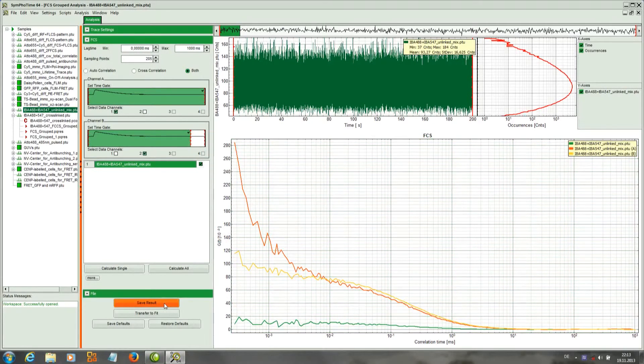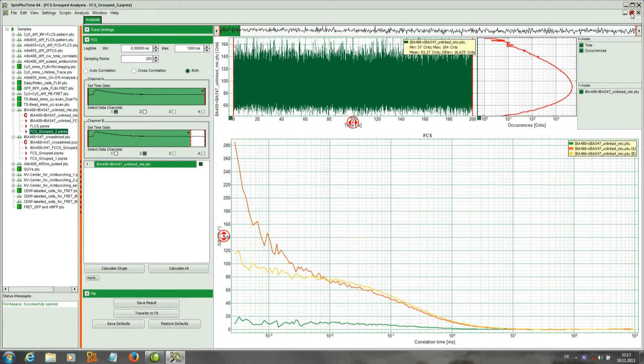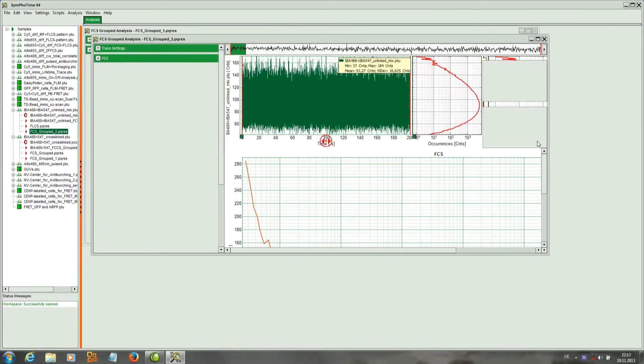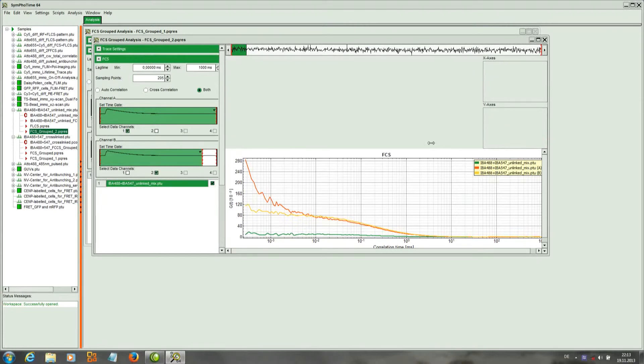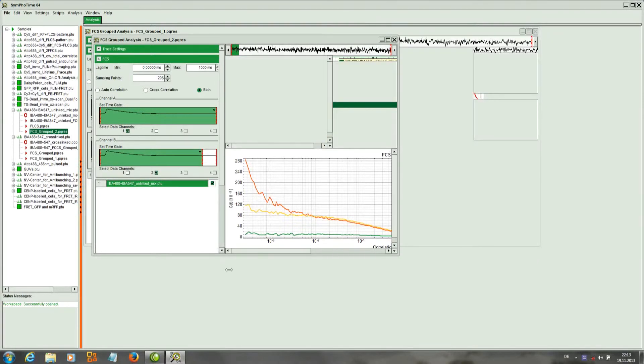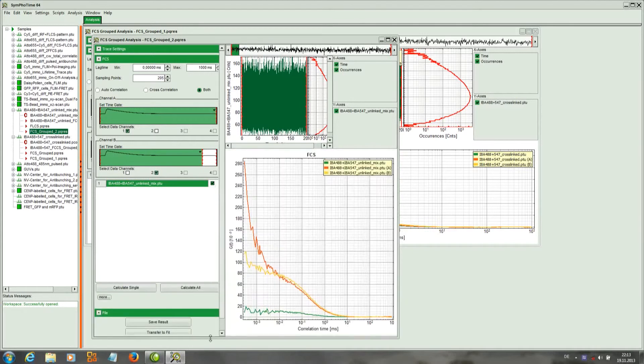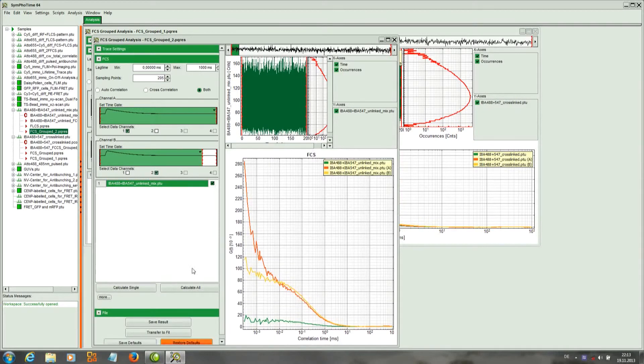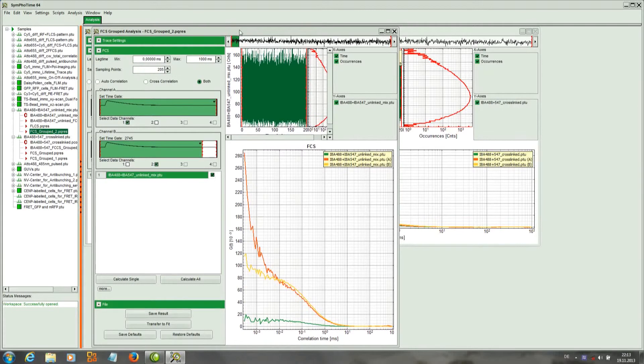We save the result and generate a result file. Now what I want to do is compare two files and put them side by side so that you can see the effect of the cross correlation relative to the autocorrelations for a linked and unlinked sample.